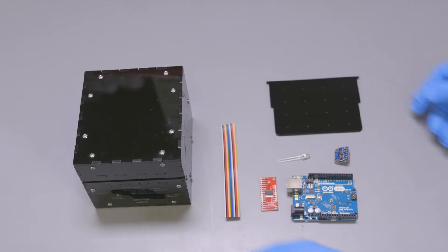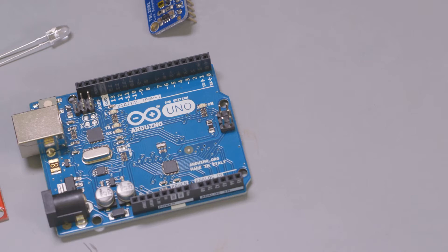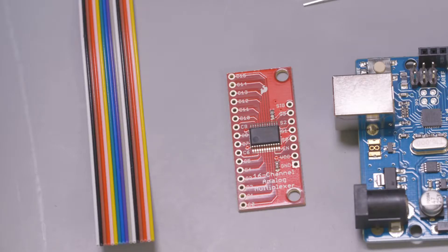All of the reader components can be purchased off the shelf. Basic electronic tools and a laser cutter are needed to build the device.